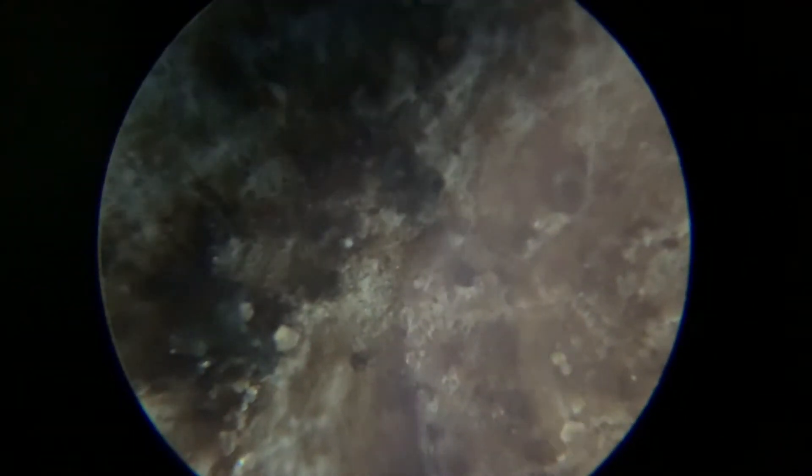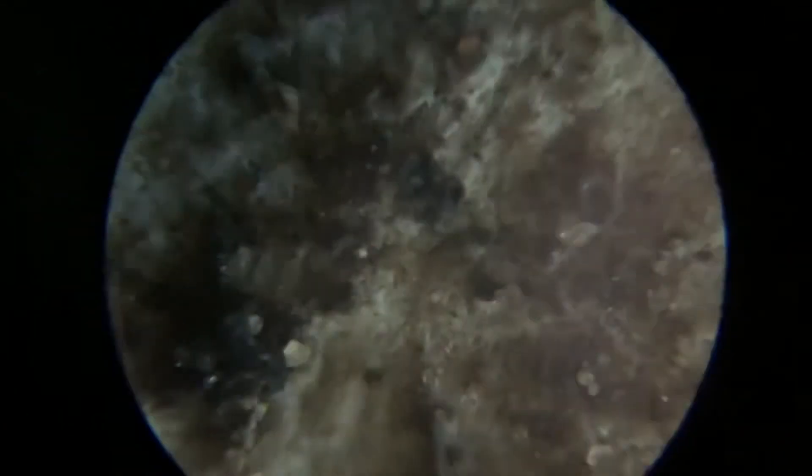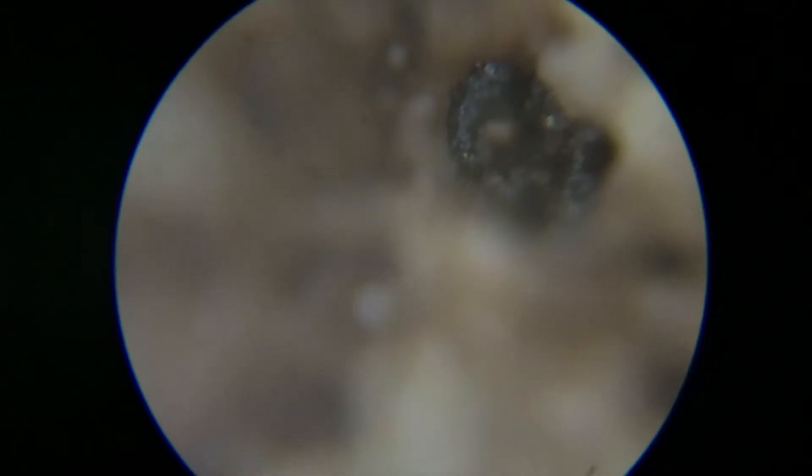It looks like the moon! It does. Wait, that's the bark — that's the bark. Focus it. Other way. Oh! That looks so cool.